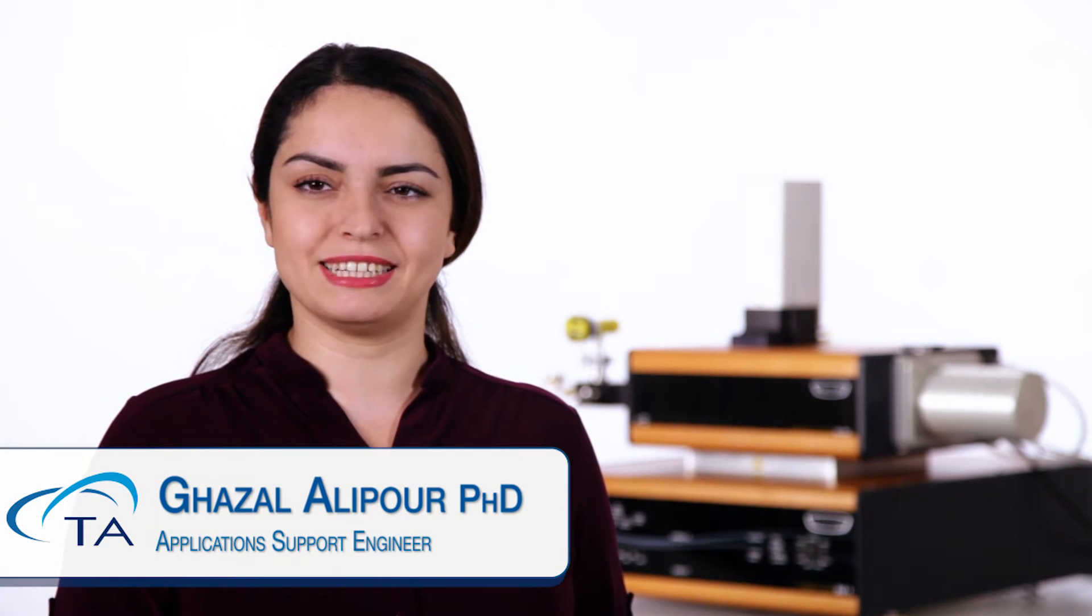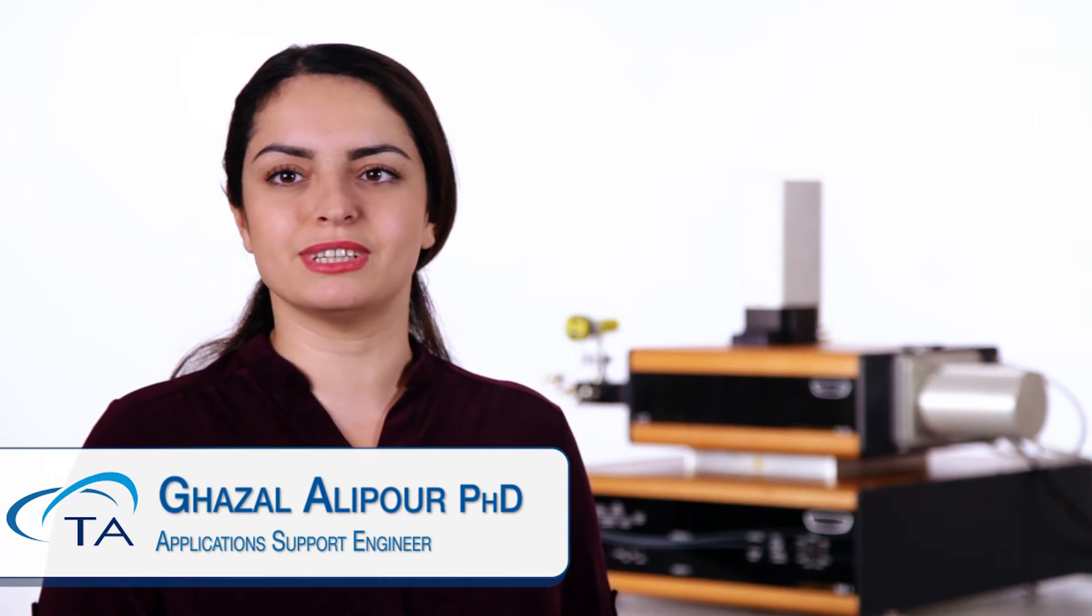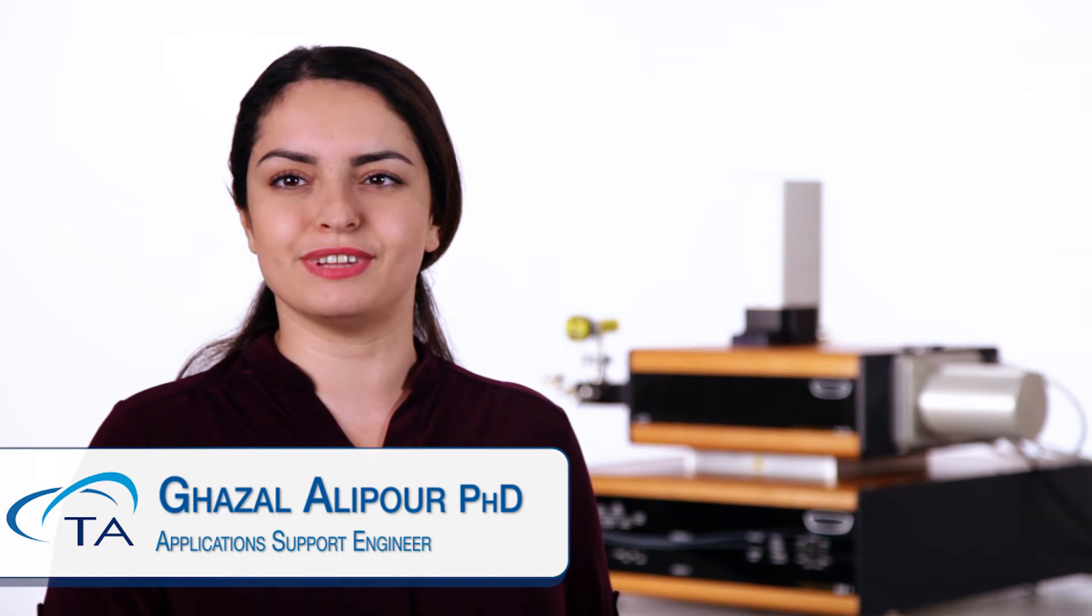Hello and welcome to another TA Tech Tip. In this TA Tech Tip we are going to learn how to use the in-plane kit and FLASH instruments.